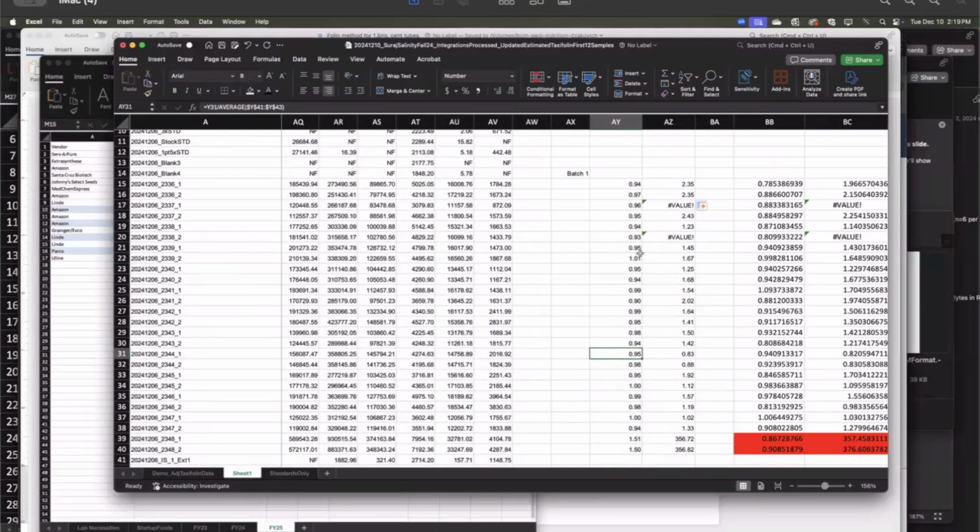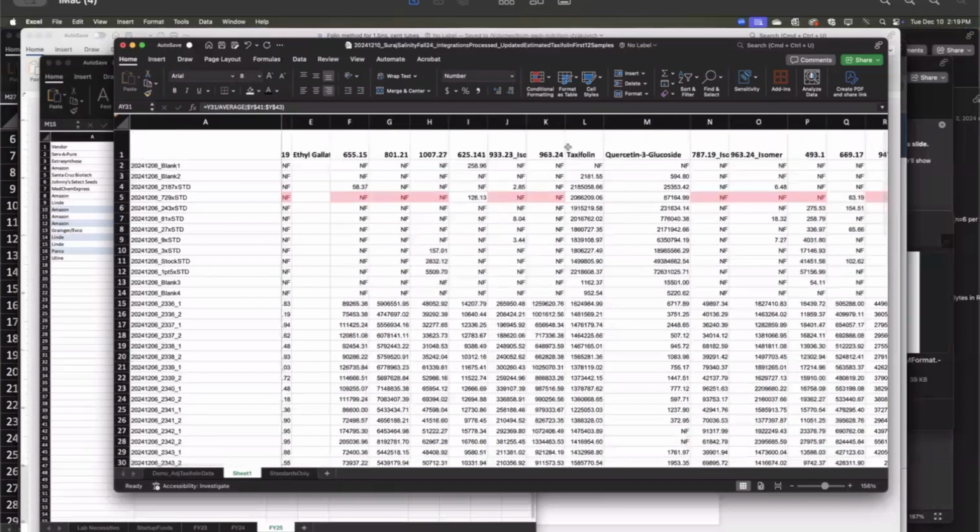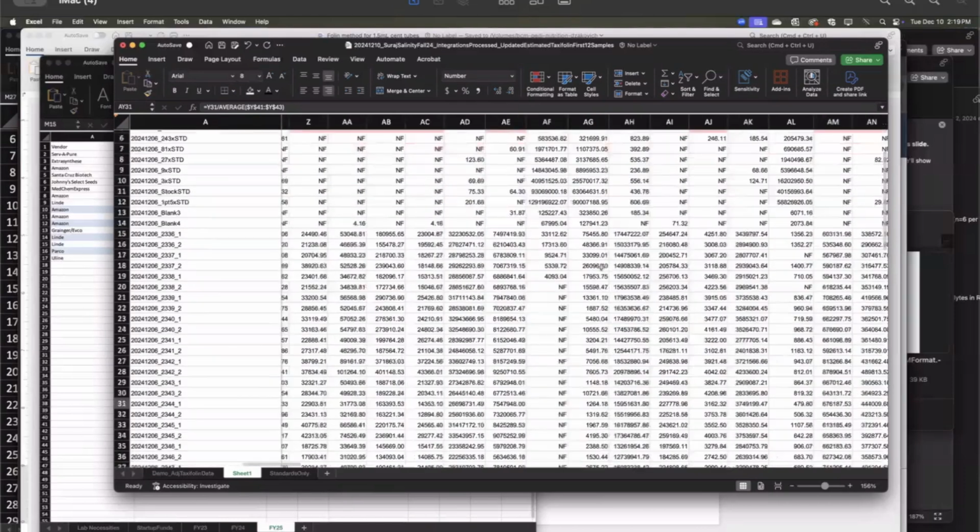And so that's where that third internal standard comes in that we add when we're redissolving our samples, which is taxifolin. This isn't naturally in spinach, so anything that we see is going to be from what we added. We add this to help understand how the background of our samples and the instrument itself might be affecting the signal that we're seeing.